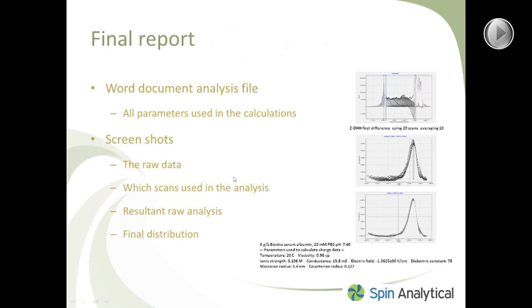When you've done an analysis and you're happy with the analysis you've got, you can save a final report. The program writes this out for you automatically. It's a Word document that you can read into other programs and work with. It saves for you all the parameters that were used in the calculations, your sample description, the solvent description, the various parameters used for the charge calculations.